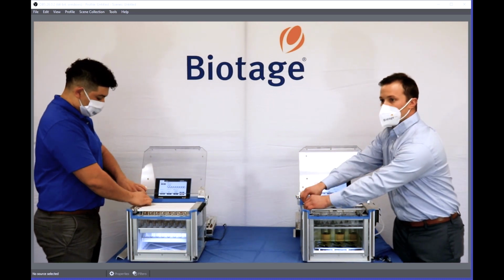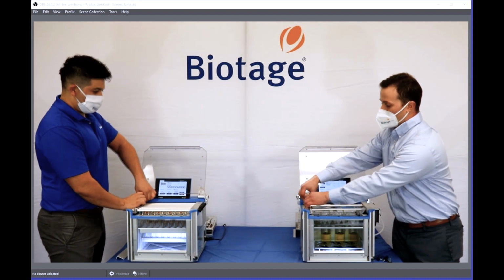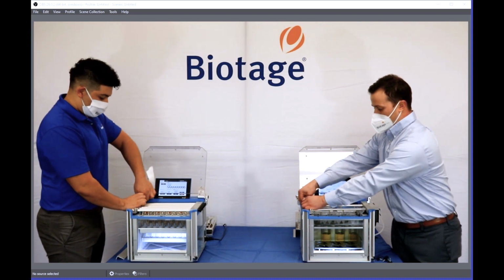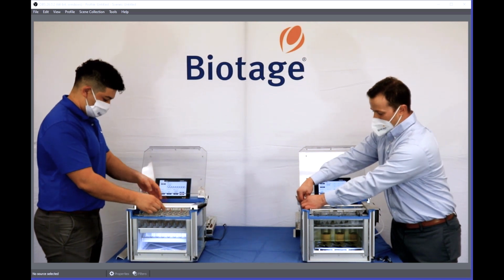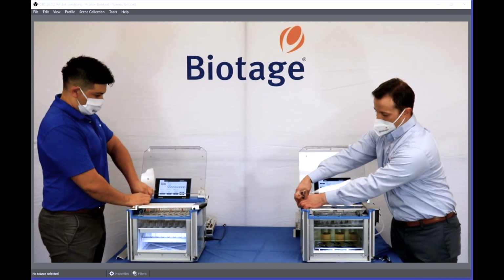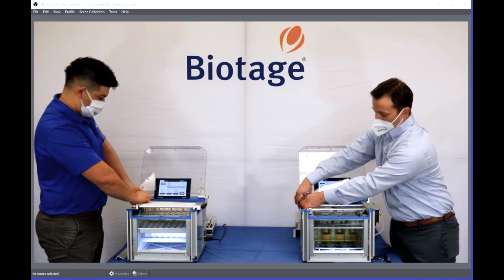I've already got this one off, so you don't have to worry about yours. Well, you want to swap? We can swap each other. Oh, perfect. Let's do that. We will swap manifolds. I will turn this into an LV. So each manifold has the 6 lines going to the manifold with quick connects on them.